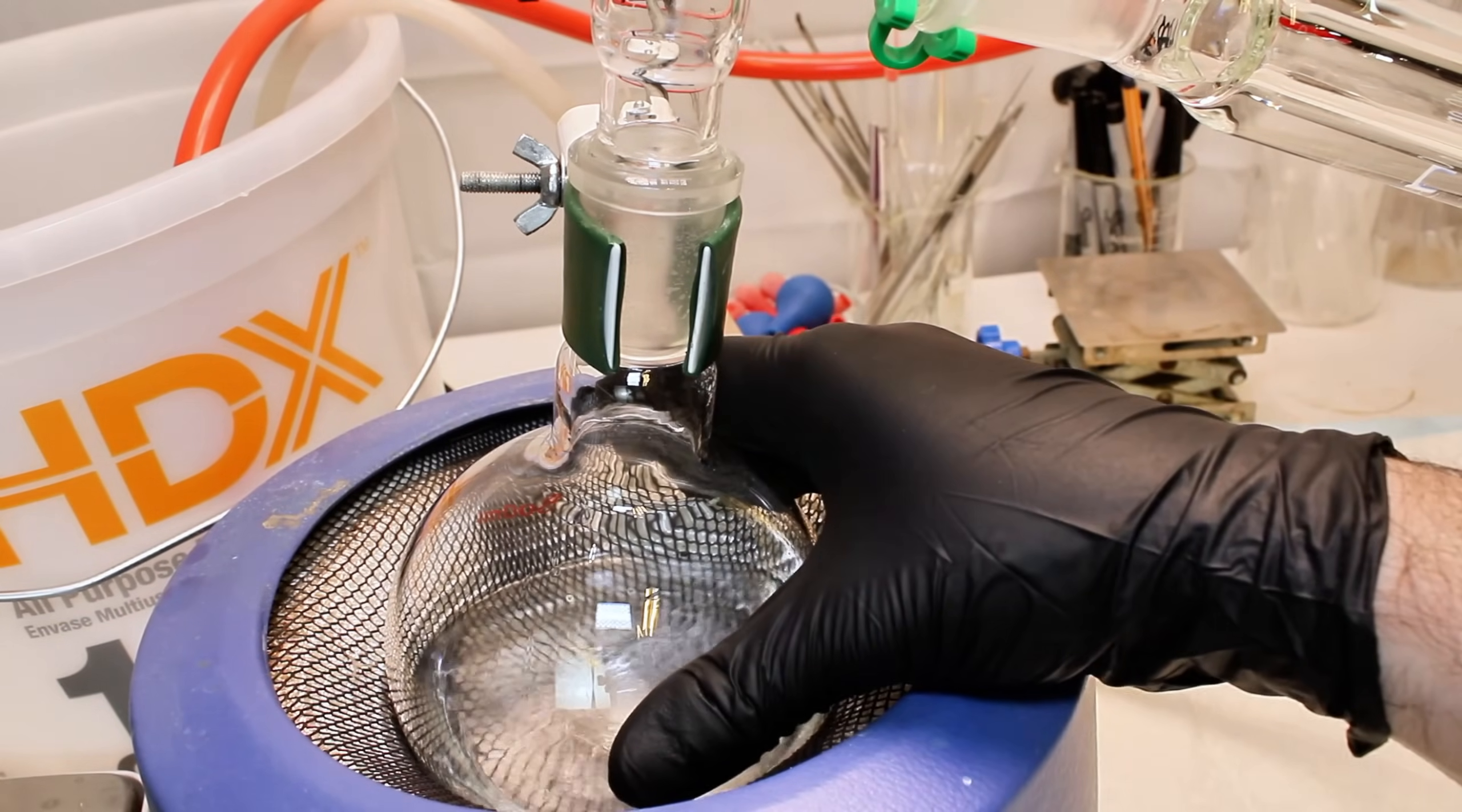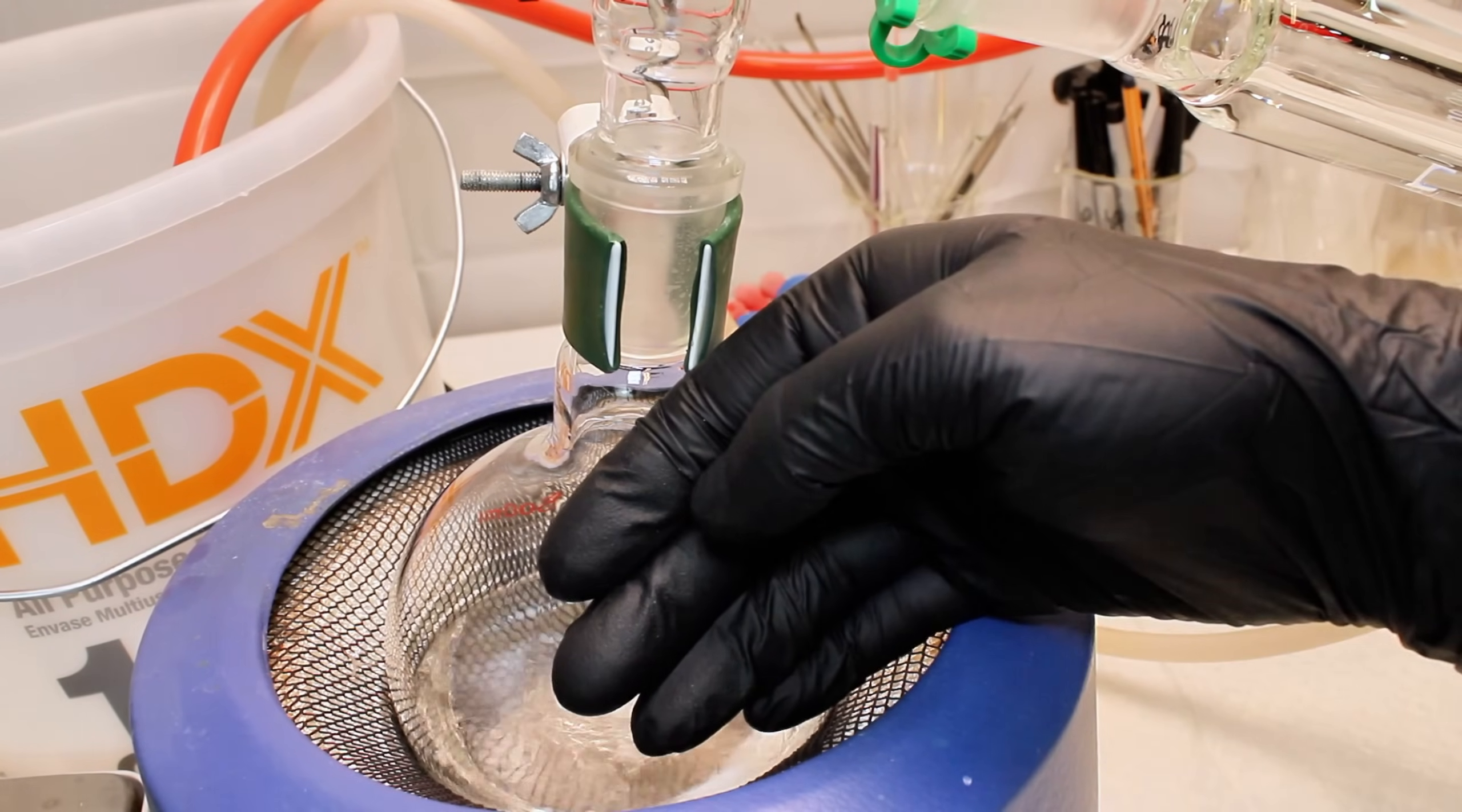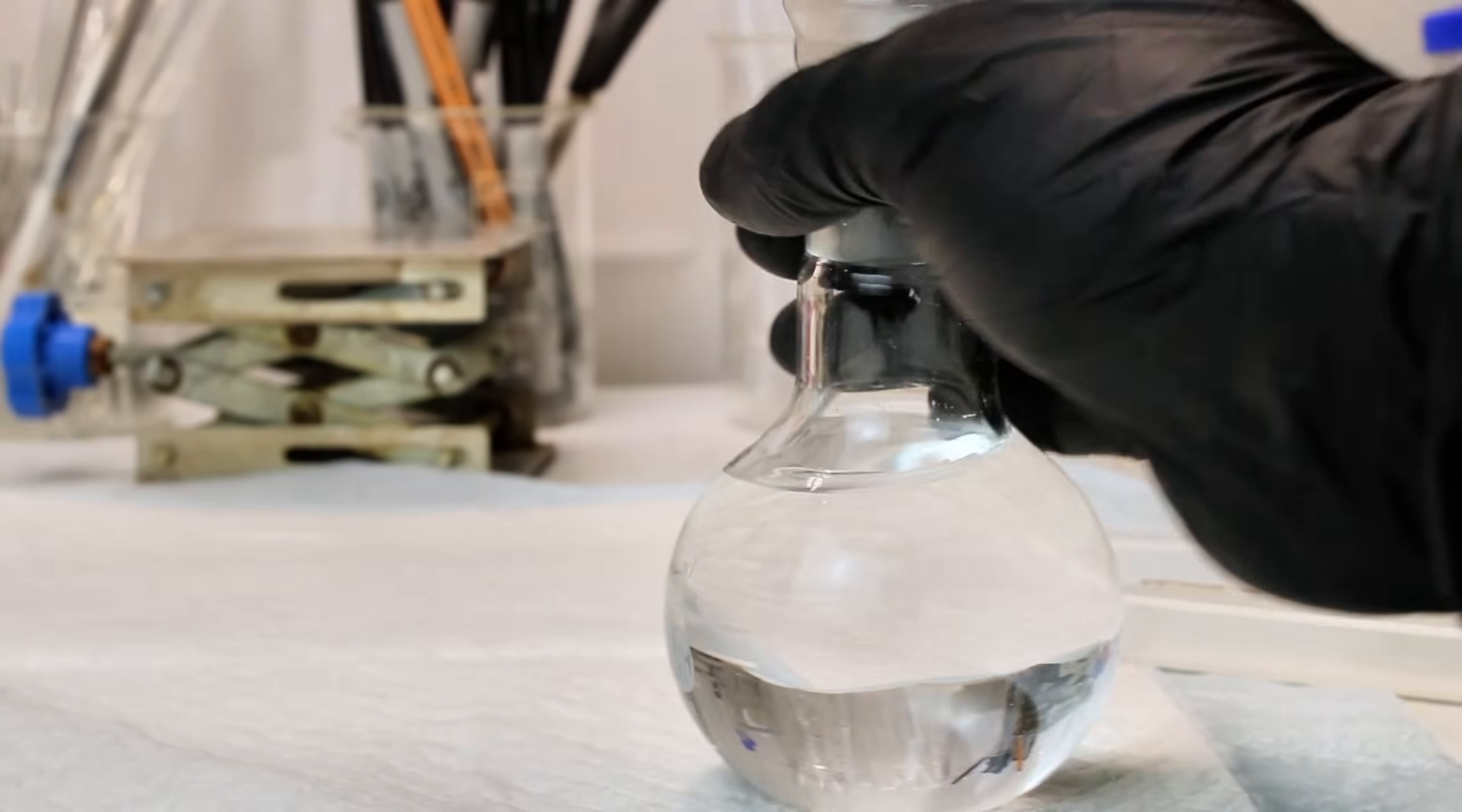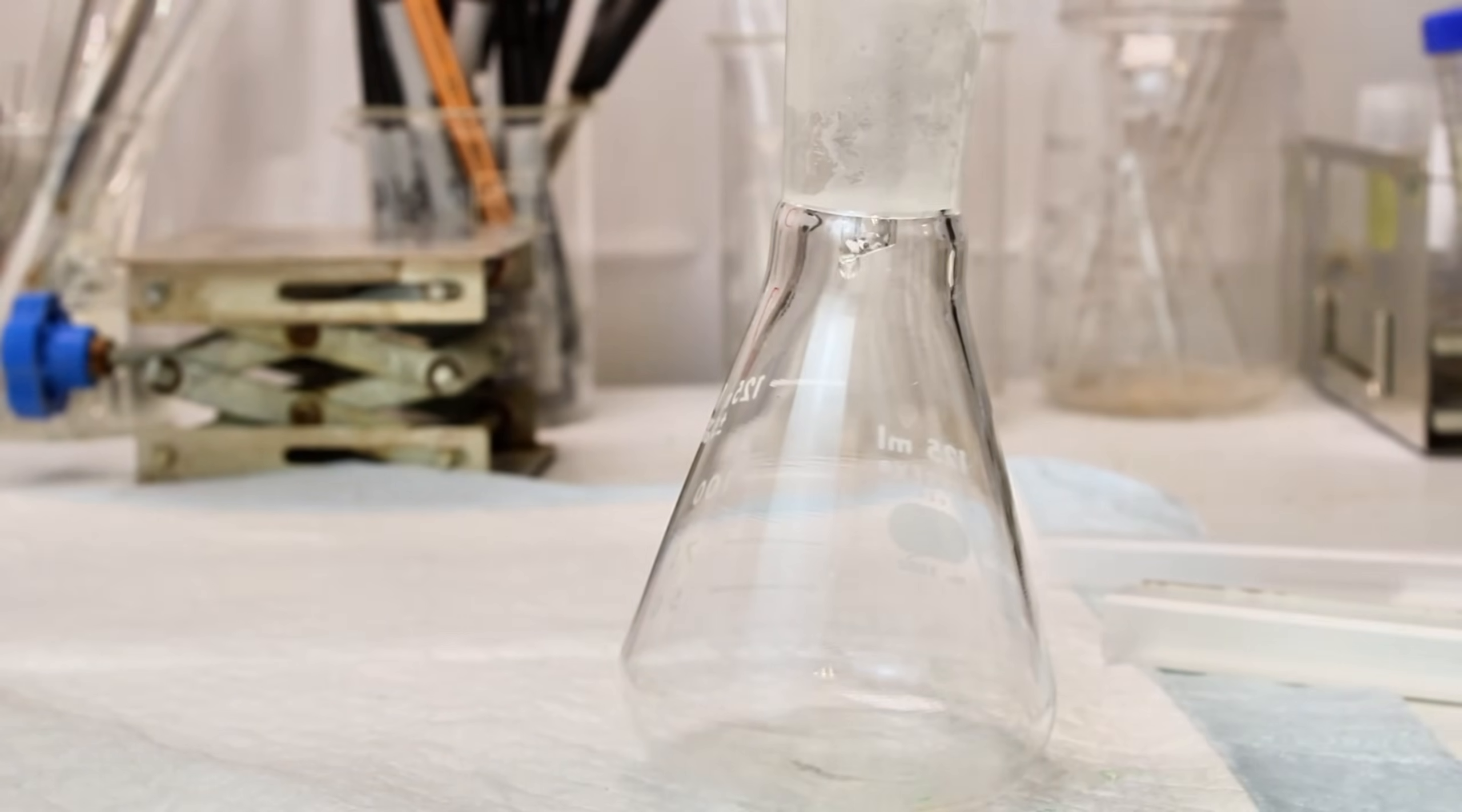This distillation is conducted at such a low temperature that you can easily touch any part of the apparatus, which is kind of weird to me. I collect everything below 38 degrees celsius, and then switch out my collection flask and collect everything between 38 and 77 degrees celsius, which should be a mixture of ethanol and ether.